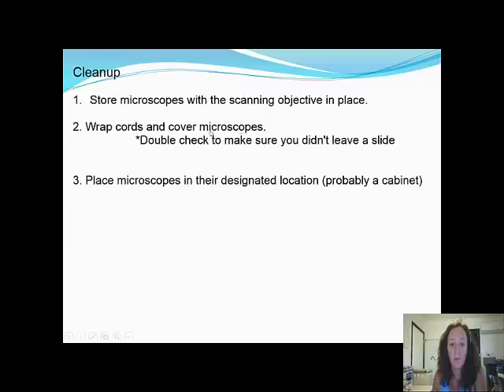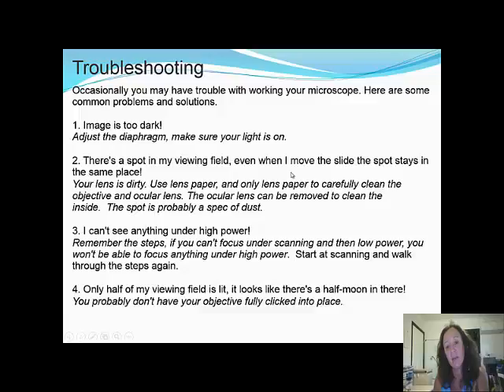Troubleshooting — here are some common problems and solutions. If the image is too dark, adjust the diaphragm and make sure your light is on. If there's a spot in your viewing field that stays in the same place even when you move the slide, your lens is dirty — use only lens paper to carefully clean the lenses; it's probably just a speck of dust. If you can't see anything under high power, remember the steps: if you can't focus under scanning and then low power, you won't be able to focus under high power. Start back at times 40 magnification and walk through the steps again.